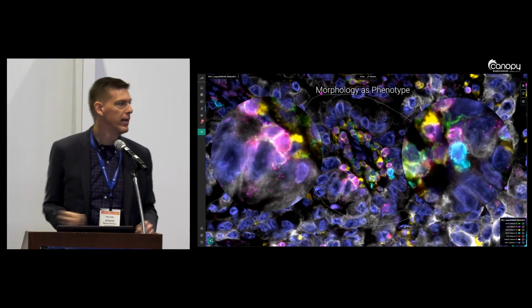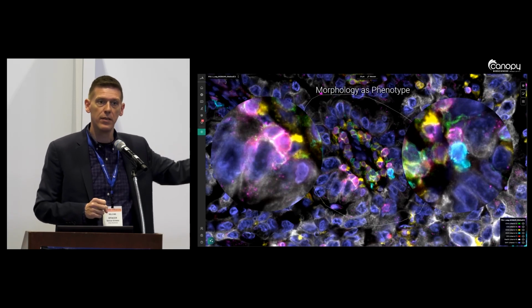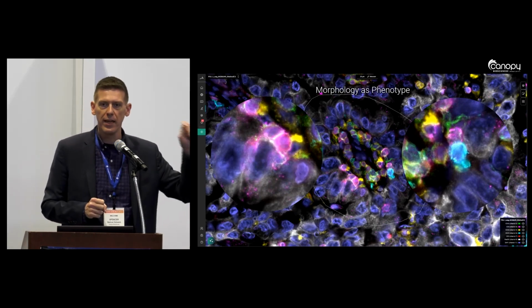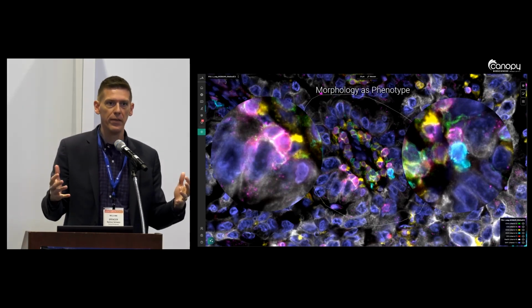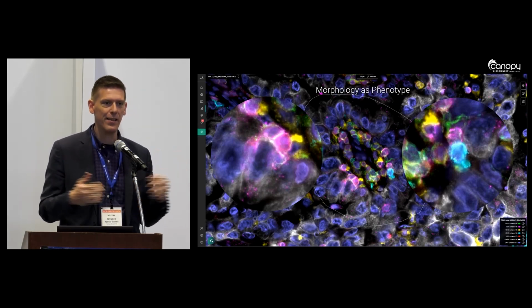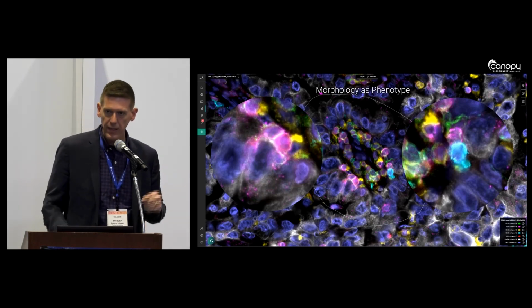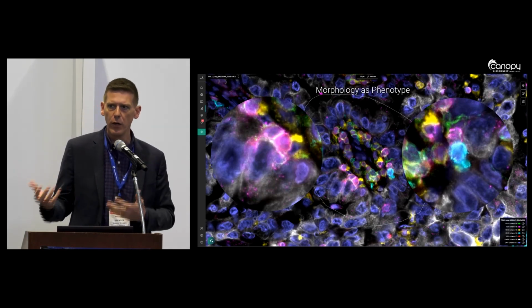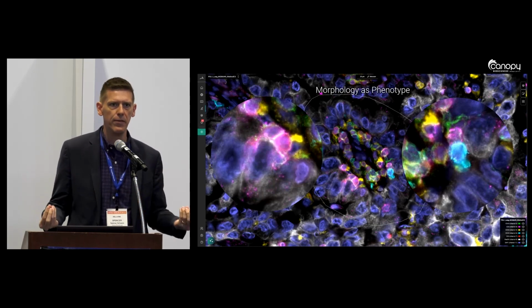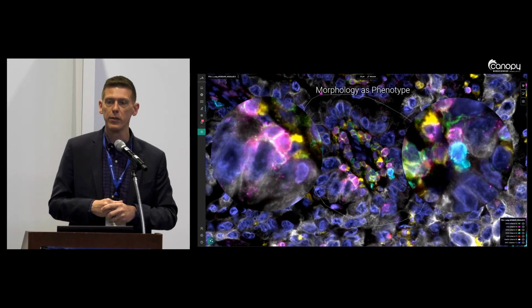I can see it. Same thing when I talk about interactions between these tumor cells and these being T cells on the left. I know that they're interacting because I can actually see the membrane enveloping around that cell. So I don't need further corollary evidence or anything that's orthogonal in order to do that. I already had that. It's called morphology. So the idea is basically that morphology can actually encode your phenotype. You don't necessarily need 50 markers in order to do that. If you have those additional markers, they're going to give you a much more clear picture of what's going on, though.